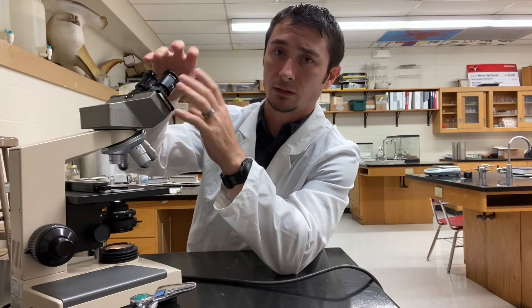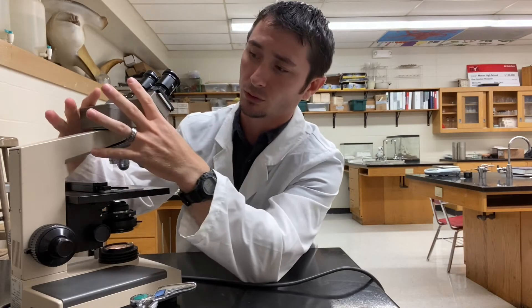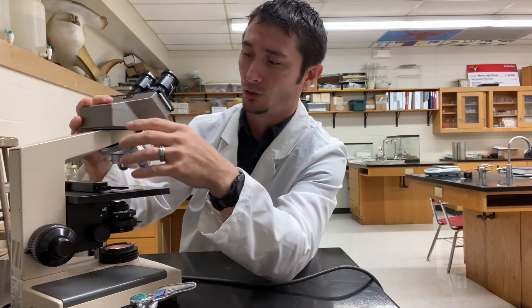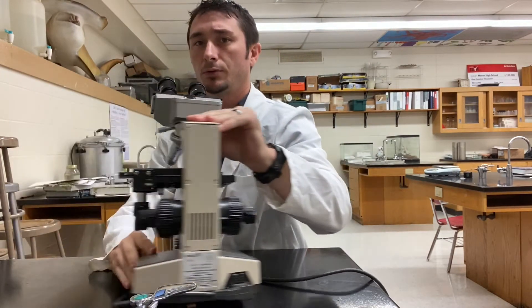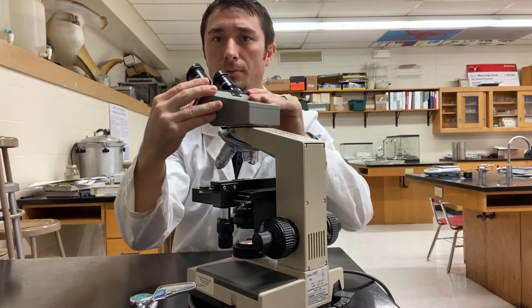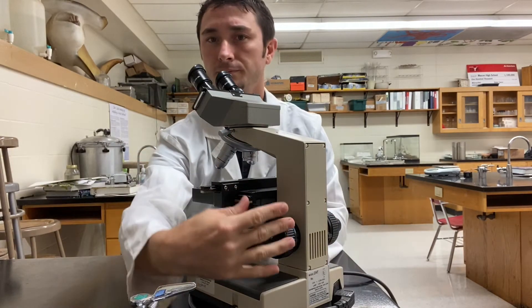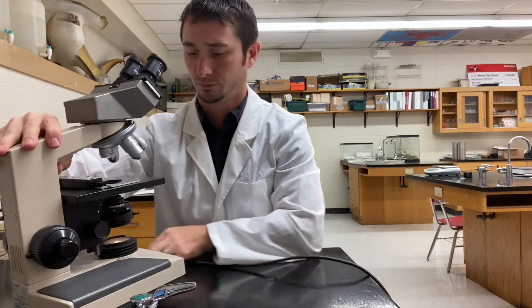You also have the eyepiece tube, which is just a tube with some lenses in it to help magnify your vision even further. After that you have what is called the head of the microscope — this top part up here. It swivels, and you can also tighten it with a little screw on the side that will lock it into place so you can't move it anymore. As soon as you loosen it, it can rotate freely. This works great if you want to share with your lab partners.